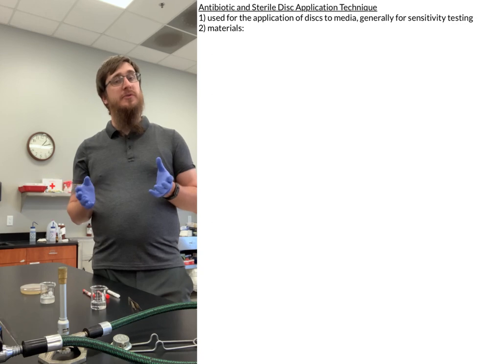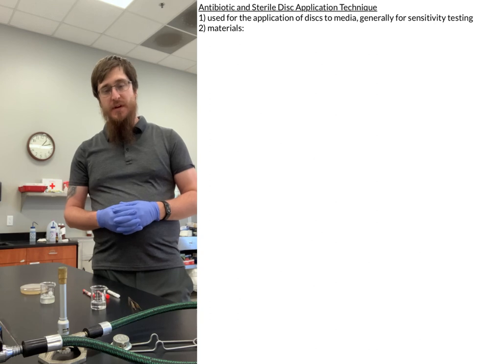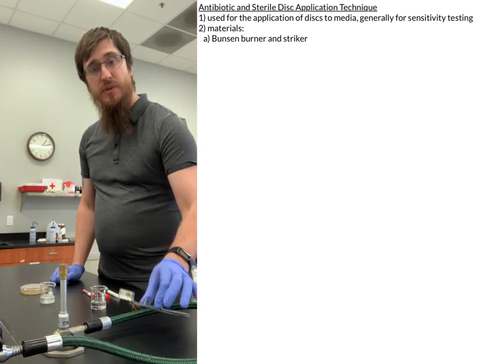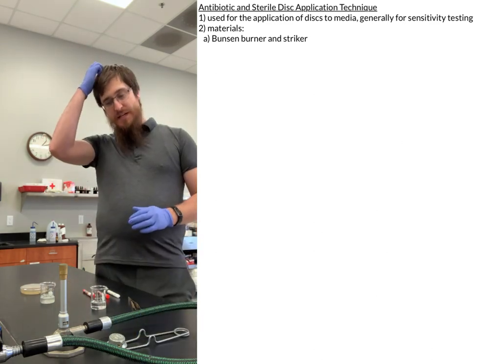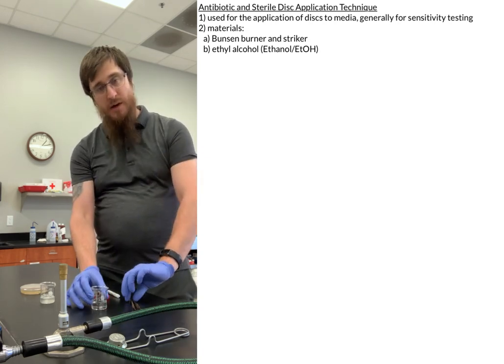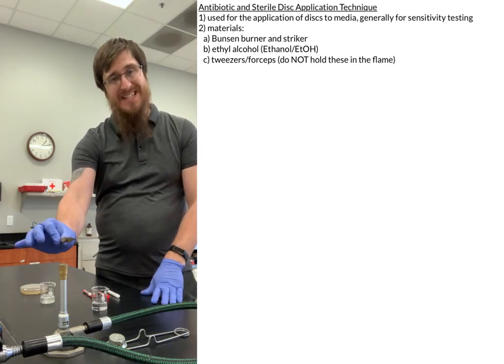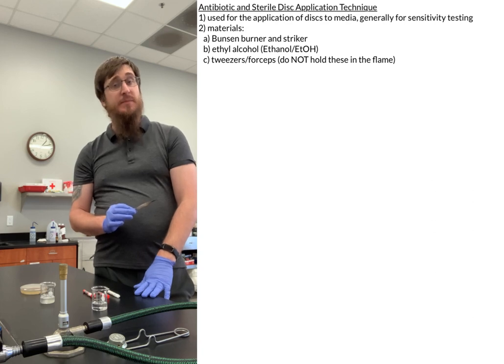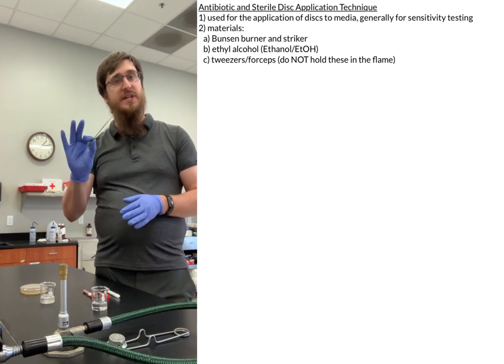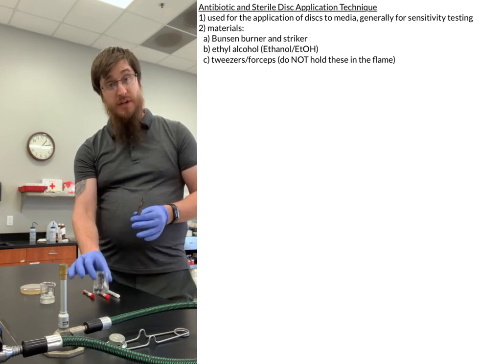So let's talk about the materials that you need in order to do basically a disk transfer or a disk application. So you will need your Bunsen burner and a striker to light it. You're going to need basically ethyl alcohol, considering that we're going to be using our tweezers or forceps. Since these are metal, we cannot hold them inside of the flame itself. So I'll show you a different aseptic technique that we are going to be using in order to keep our little tweezers sterile, or at least as clean as possible, again using our ethyl alcohol.